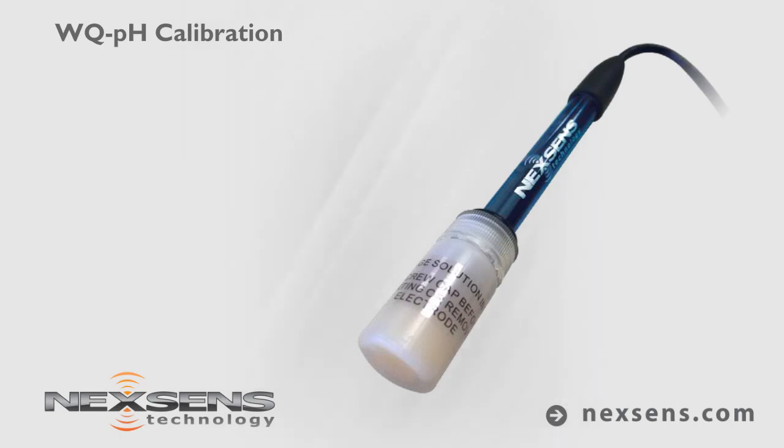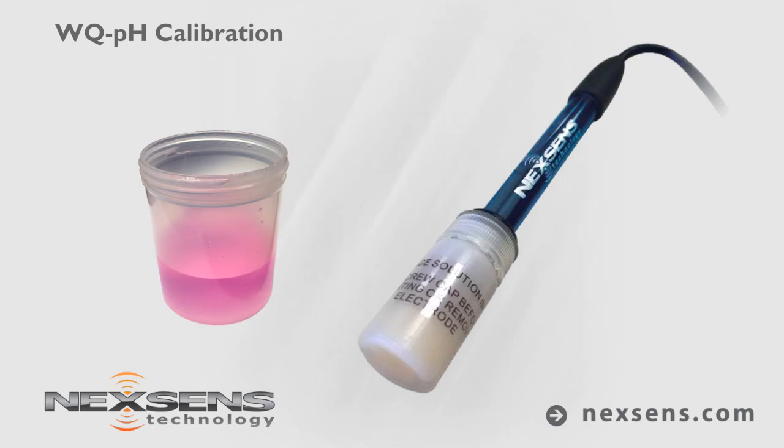When not in use, the WQ pH sensor should be stored in the original storage solution or pH 4 buffer. A storage bottle is included for convenience.